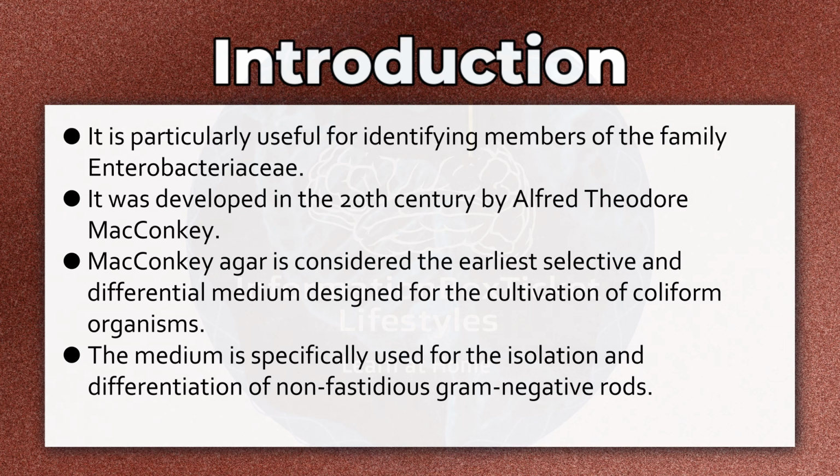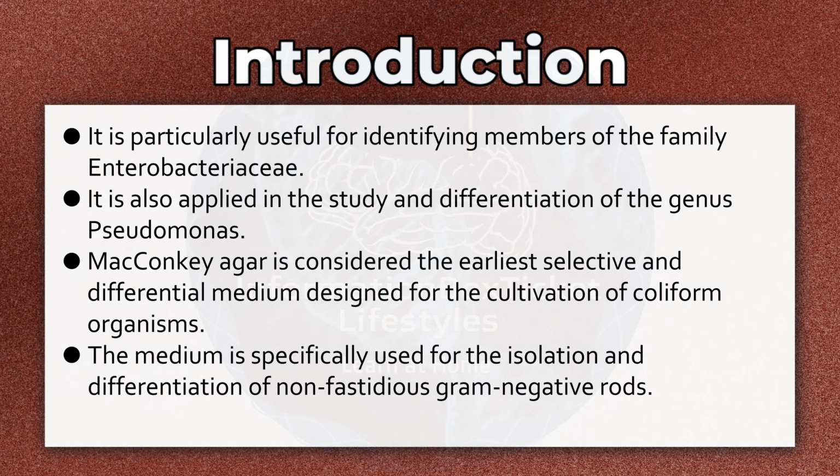It is particularly useful for identifying members of the family Enterobacteriaceae. It is also applied in the study and differentiation of the genus Pseudomonas.